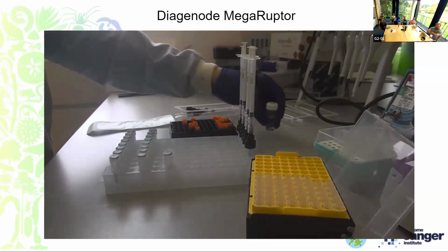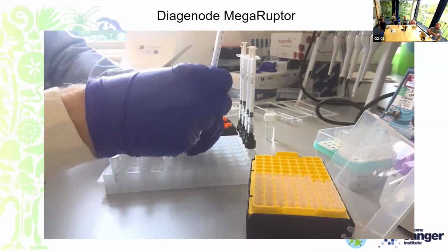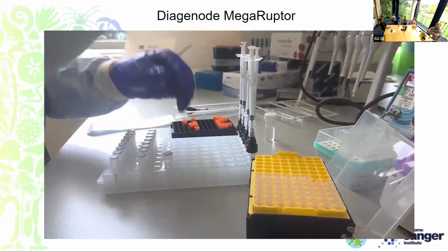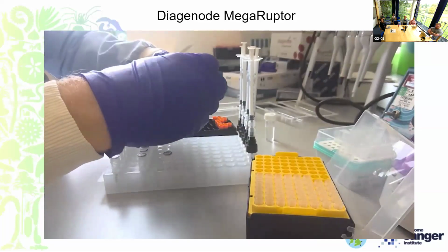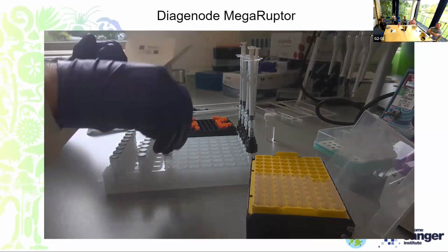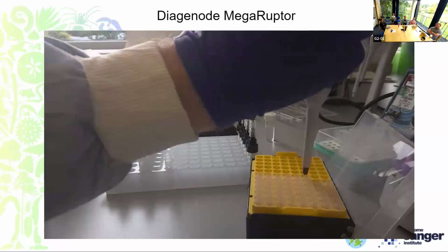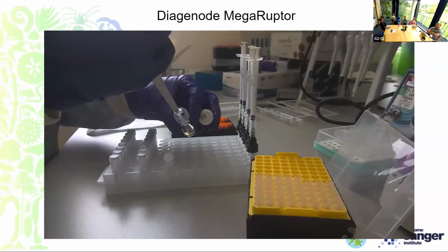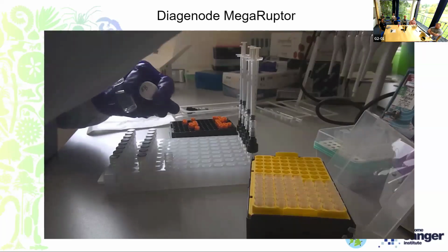To run a sample on the megaruptor, all your samples should be roughly the same volume. So we generally aim for 150 microliters. Each megaruptor can take up to 8 samples at a time. The amount of DNA we put in is dependent on the species and their genome size. For species with large genomes, we tend to put in more DNA, while for smaller genome size species, we can afford to put less in.